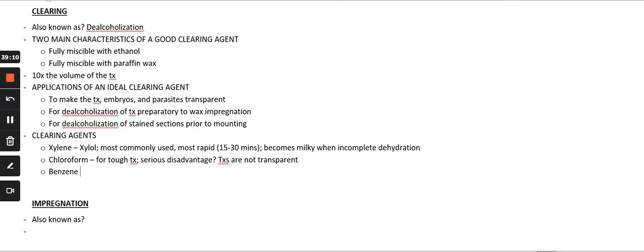Moving on, we have benzene. Now, benzene, guys, this one is, di ba, katong second-rate copycat, the middle child, the problematic middle child. Now, our benzene, it is rapid, okay? Di ba? Ang gikuan ani niya kay 15 to 60 minutes ang iyahang clearing time. 15 to 60 minutes, and it is considered as carcinogenic.